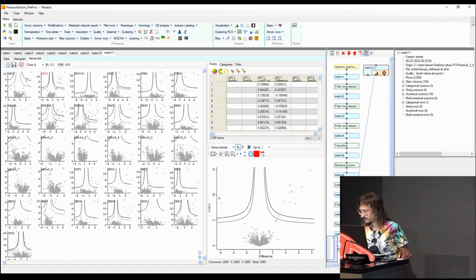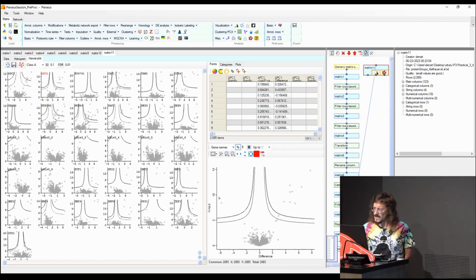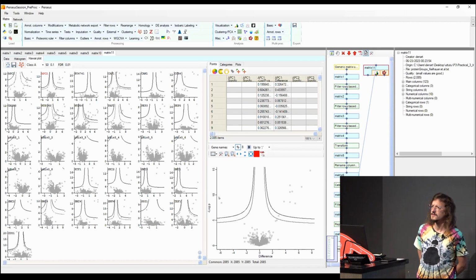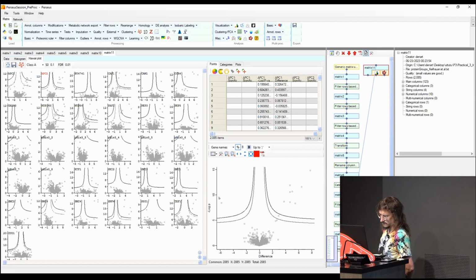Yeah, one question about the y-axis. The log p-value, this is on a minus log 10 scale, right? Yes, minus log 10. So the upper line, with the 1% false discovery rate, shouldn't this sit at something like 1.3, sorry, the 5% line, the lower one, at 1.3, because this would correspond to 5%? No, because it's really the p-value that's plotted on the vertical, not the q-value. So it's really the p-value.